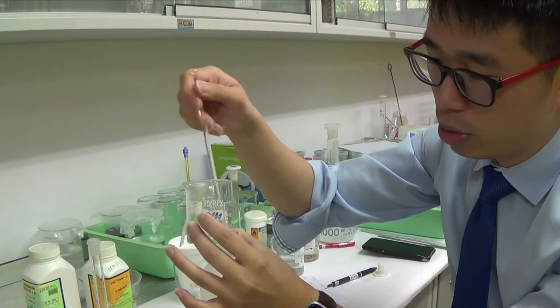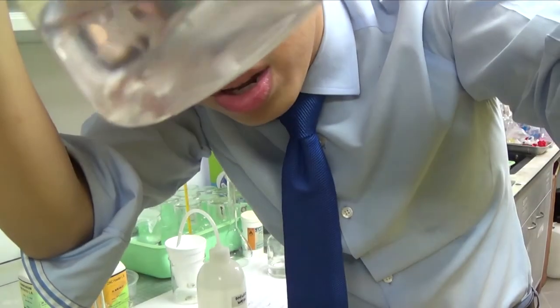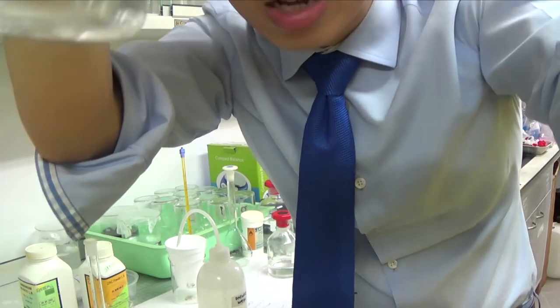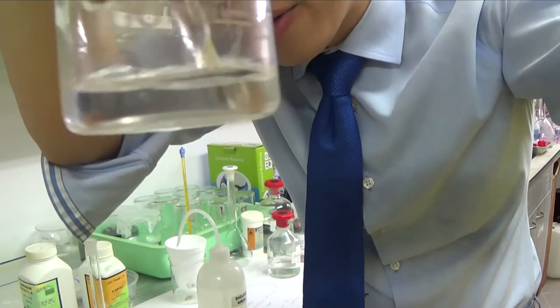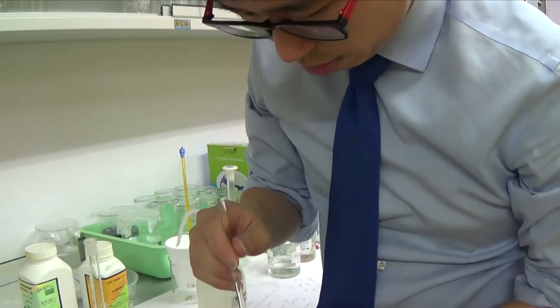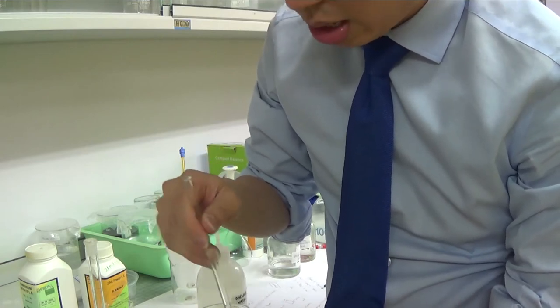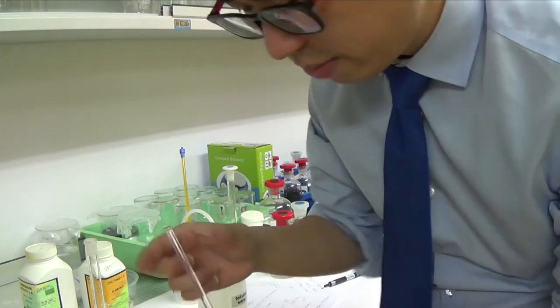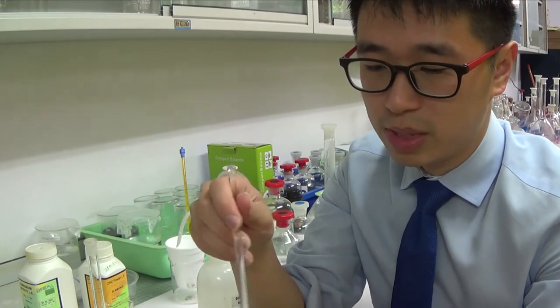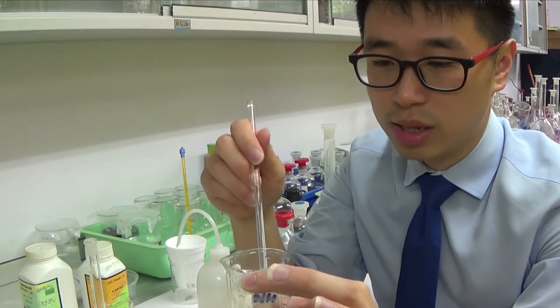All ammonium salts are soluble in water, and all nitrates are soluble in water, so as you can see it dissolves pretty quickly in less than 25 ml of water. This reaction is actually endothermic — when I feel the beaker, the water is getting cooler than room temperature, meaning the system absorbs heat energy from the surroundings.